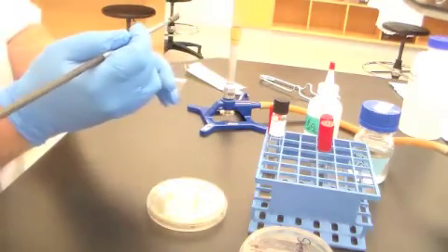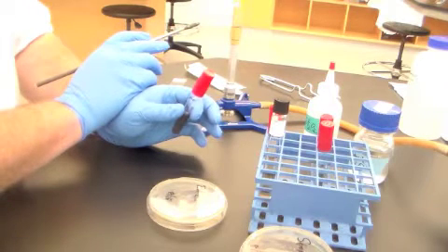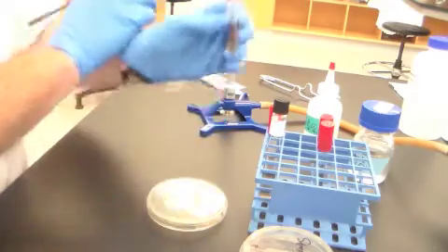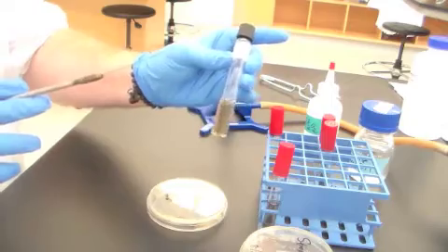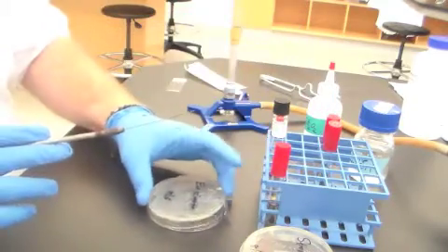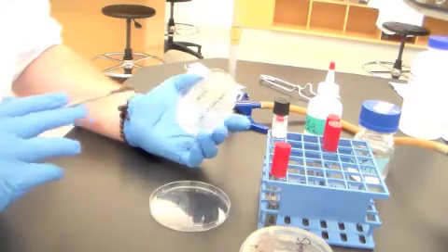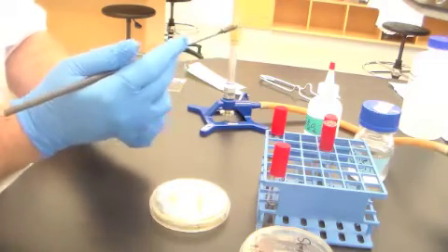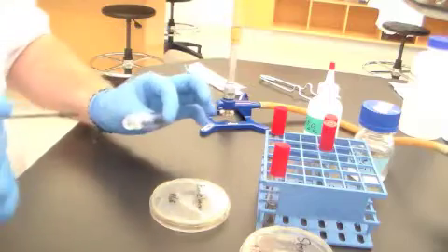Flame again, close it up, sterilize my loop. In both the lysine decarboxylase, which is this medium, and the ornithine decarboxylase medium, the idea is to come up with an idea of whether any of these bacteria have the ability to decarboxylate those particular amino acids. This is an important diagnostic tool.